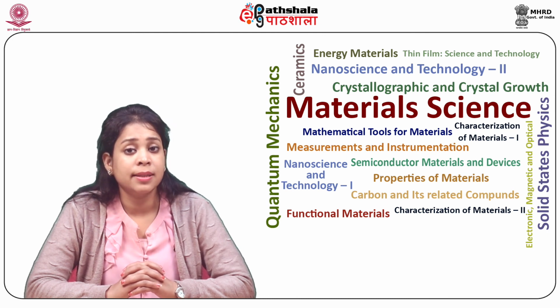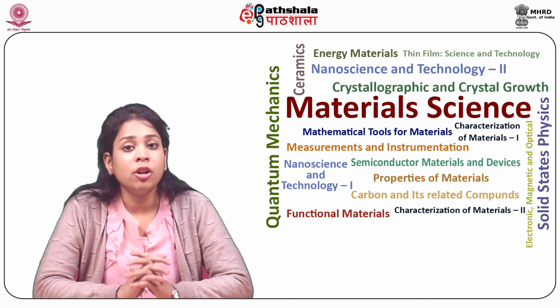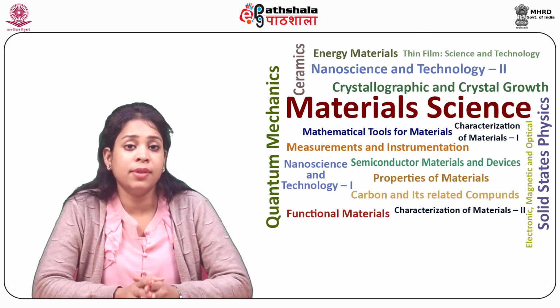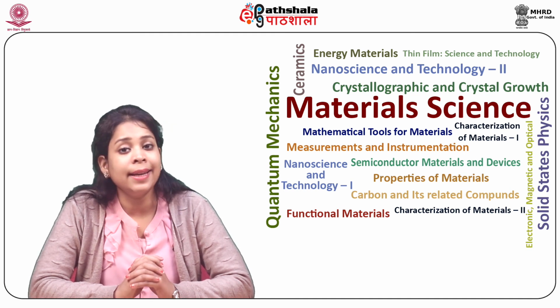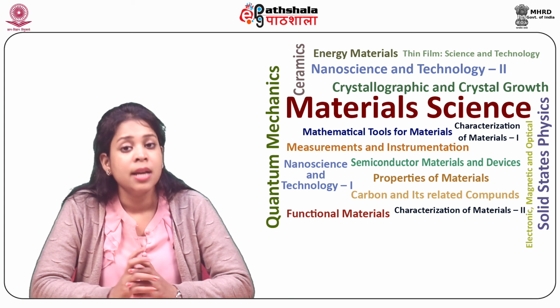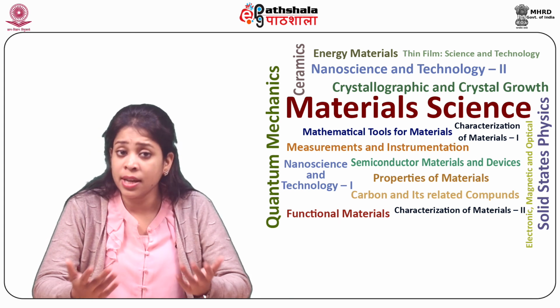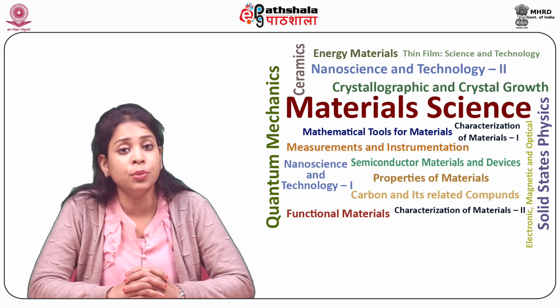This alignment is limited by quantum mechanics. The following conclusion can also be reached from this module, that mu directly controls the sensitivity of the NMR experiment, such that the sensitivity increases with a corresponding increase in the value of mu.